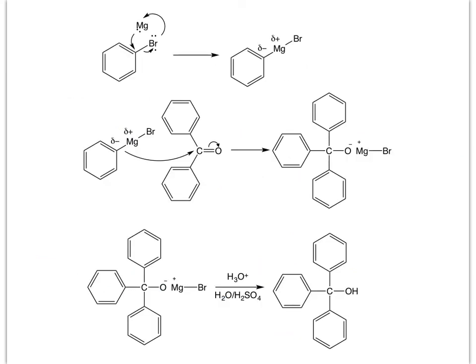Okay, so our specific Grignard reagent, we're going to use phenylmagnesium bromide, so we're going to use the phenyl ring. And we're using the flexibility we have here because our bromine is on an sp2 hybridized carbon. I've shortened the mechanism, but you can see the relative attacks.